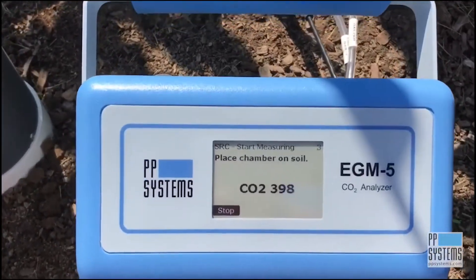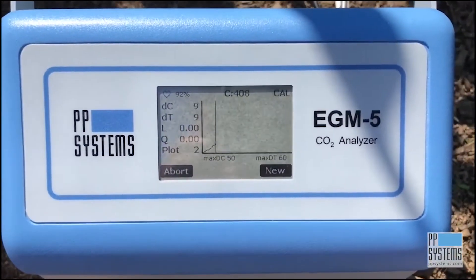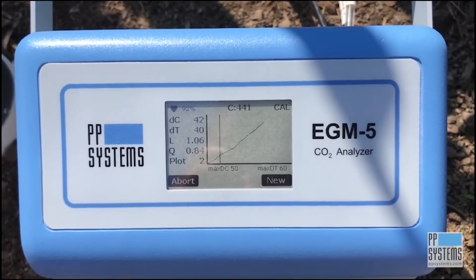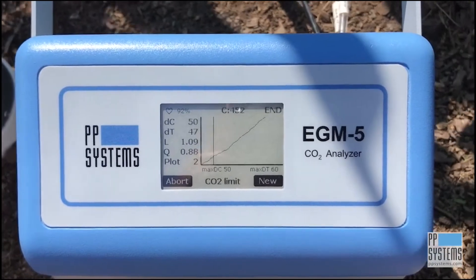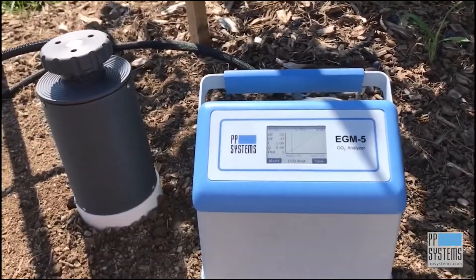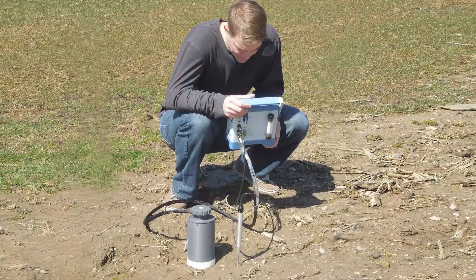You will now see your data being monitored, updated, and plotted in real time. When you reach the previously set delta time or delta CO2, whichever comes first, your measurement sequence will terminate, saving all data points right to your USB flash drive. It doesn't get any easier than that.